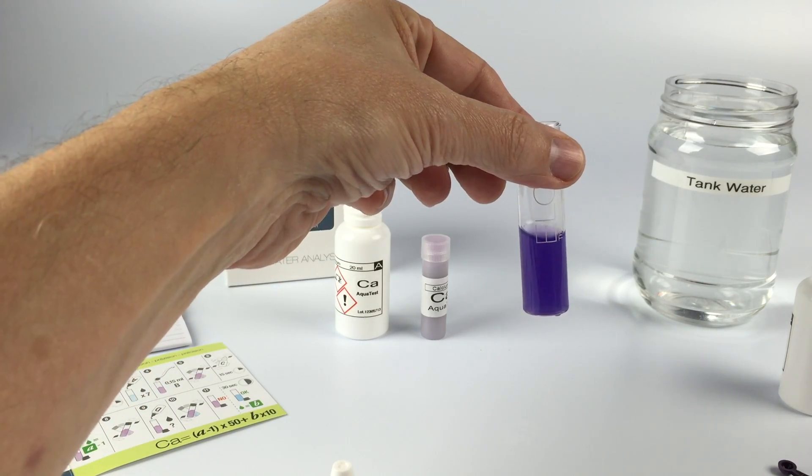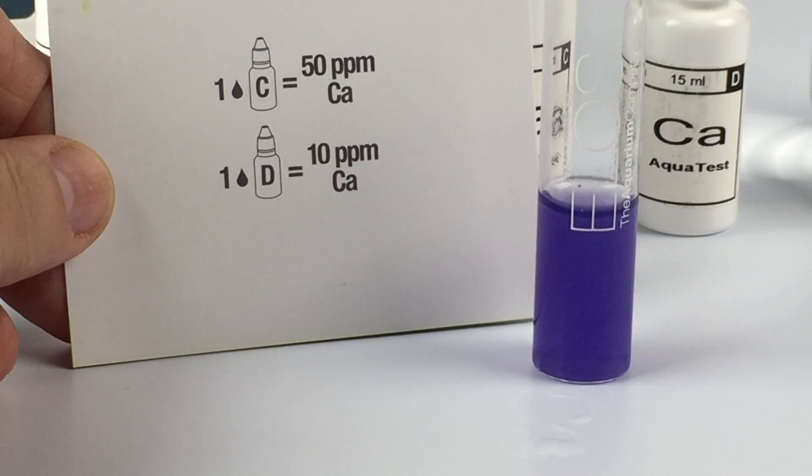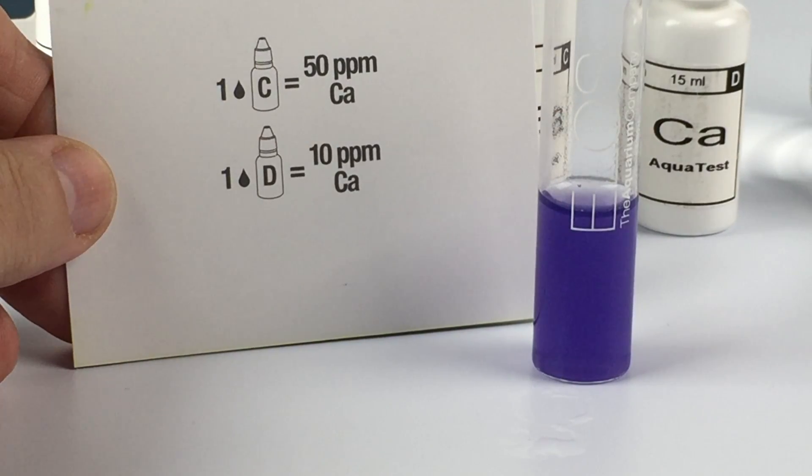That is a precise measurement using the ELOS calcium test kit. You can test your tank for approximate or for a precise measurement — that's up to you.